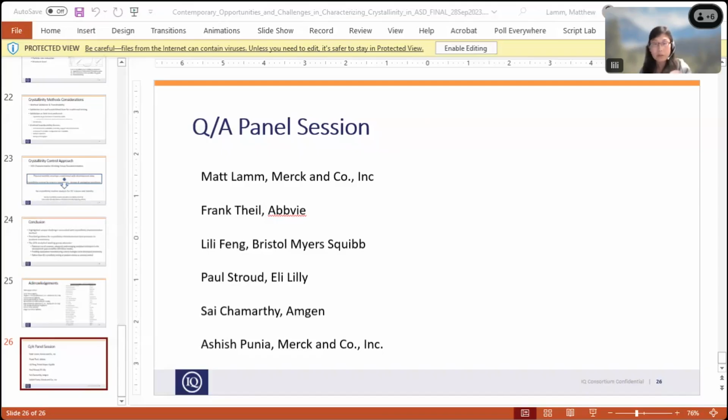The same amount of crystalline drug substance that you may be able to detect in the ASD is at a much lower absolute concentration in the drug product, so you may be facing a detection limit challenge. These are the two typical considerations, but other considerations would also include particle size control and moisture level control, which may be more challenging in the drug product than for the ASD alone.